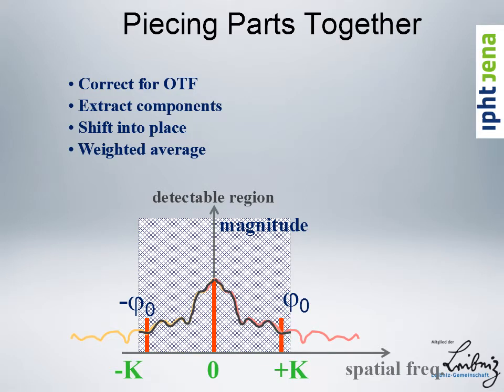And so what you really do is a trick. This is called weighted averaging. So you are saying, okay, when I'm here, why don't I take the pink curve? Because the pink curve stems from the middle where it has a fantastic transfer and the noise is low. So I simply go for the pink curve rather than this corrected gray curve that has an infinitely bad signal to noise here. So the weights differ from spatial frequency to spatial frequency. So it's a frequency dependent weighted averaging.